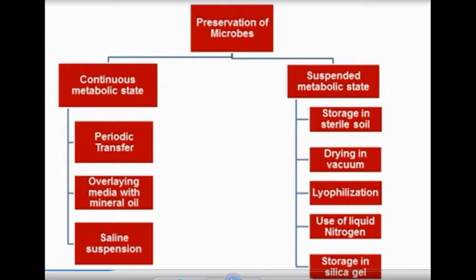Overlaying the medium with mineral oil. This is a method which is very simple and easy to perform, which has a similar drawback as that of the periodic transfer method, but the organisms can be taken directly from a medium after the incubation period without discarding the mother cultures. The organisms also can be kept at normal laboratory temperatures, and refrigerated conditions are not required.